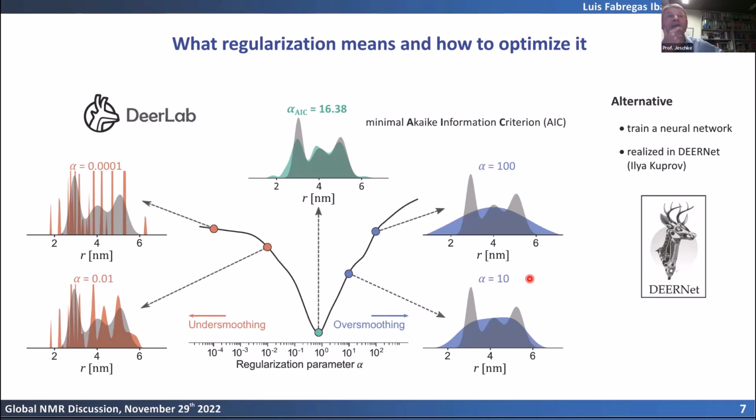So we have to immobilize the protein because we measure dipole-dipole interaction. And if the protein moves fast, then the dipole-dipole interaction is averaged out. Vice versa, the SAX measurements cannot be done in frozen solution, or not as easily. So if you could do a low temperature SAX and could get good data, then maybe this would improve.